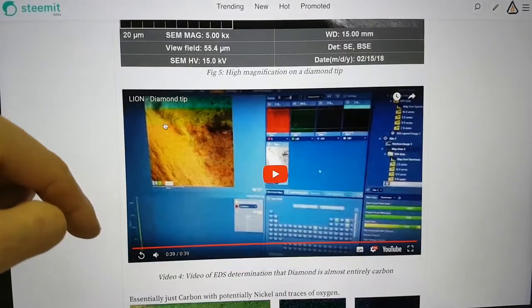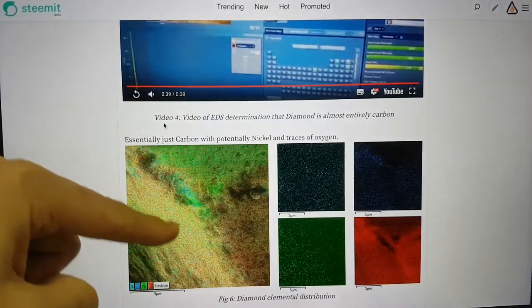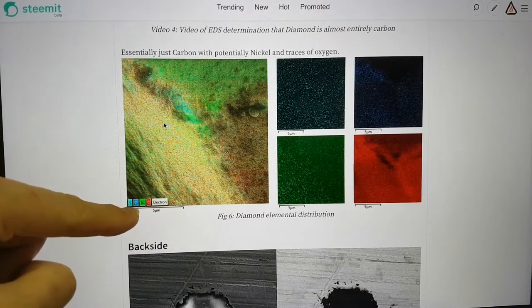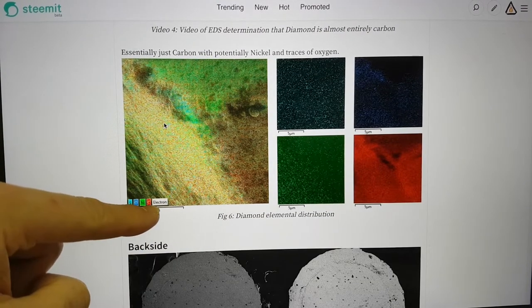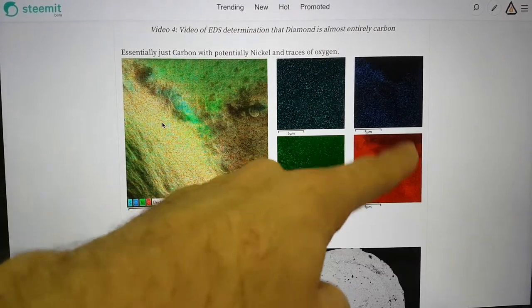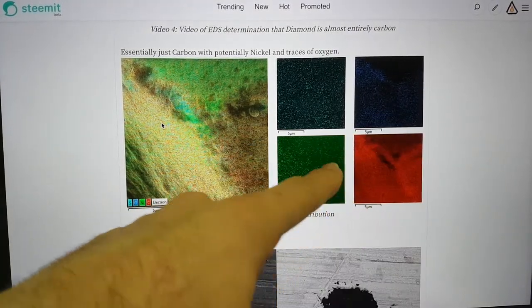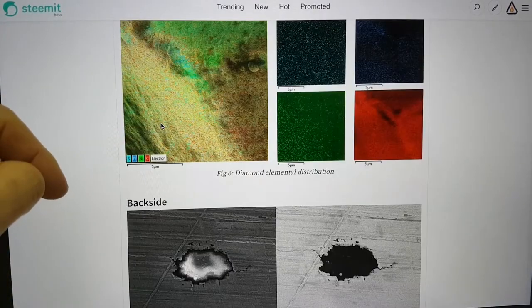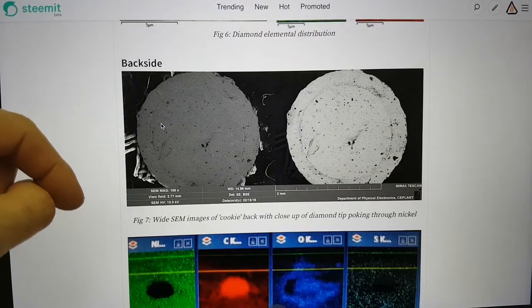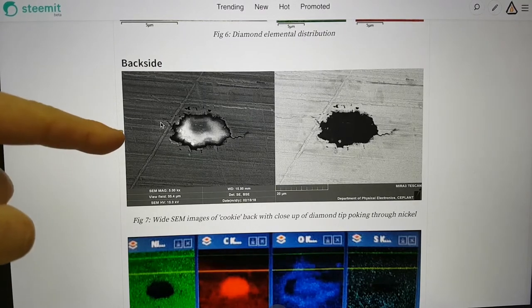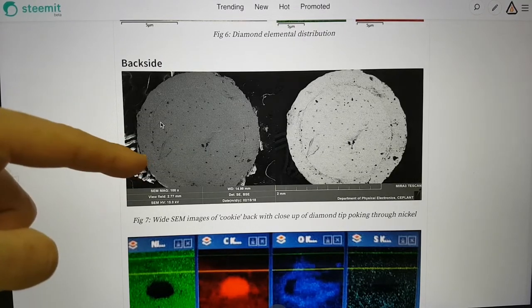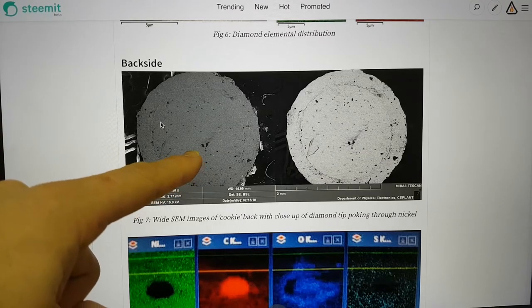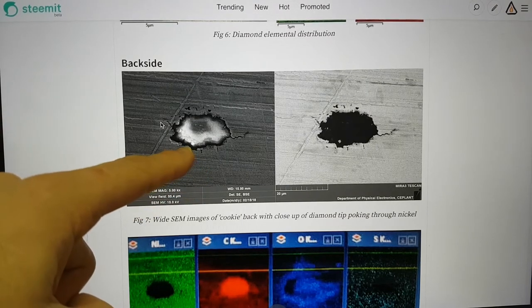When we look at that there's a video of the actual analysis and you can see that it's again essentially carbon here and it's probably seeing some oxygen on the surface maybe and some nickel refracting through potentially.